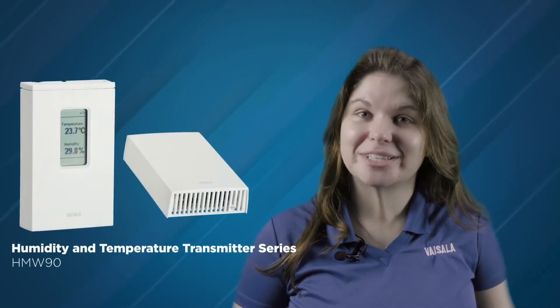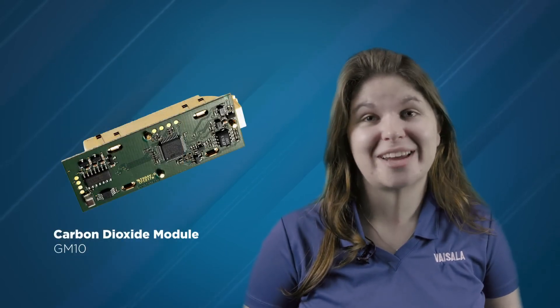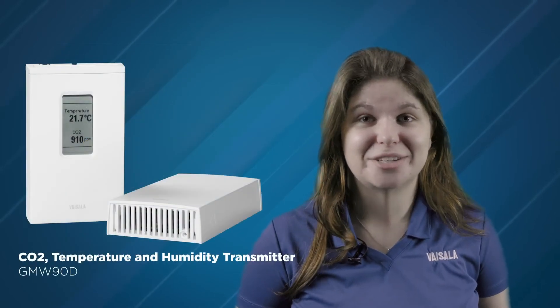The HTM10 is a humidity and temperature module used in the HMW90 series instruments and the GMW90R series instruments. Similarly, the TM10 temperature-only module is used in the TMW90 series instruments and GMW90 series instruments. And last, we have the GM10 module used in any GMW90 series instrument.